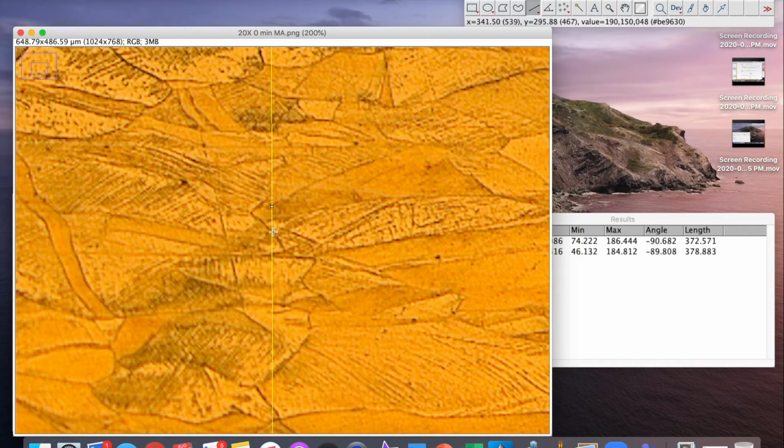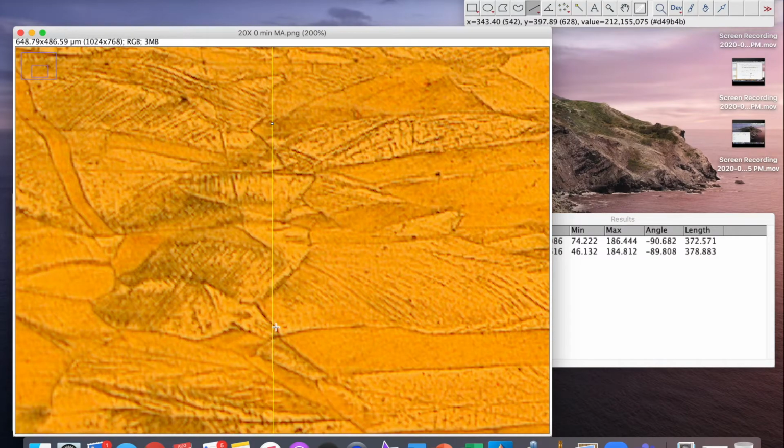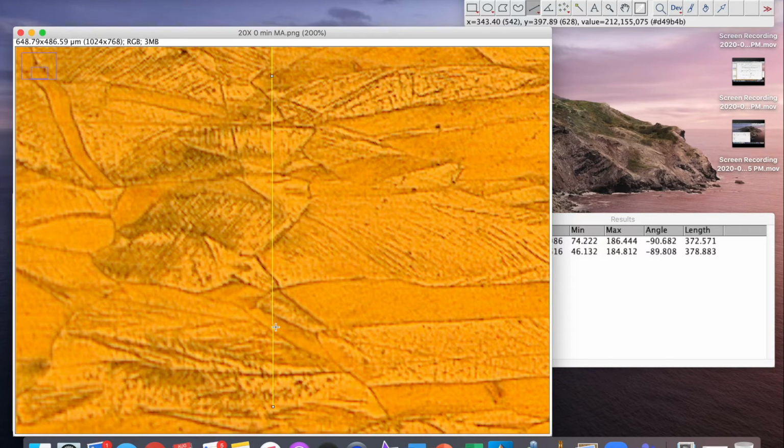Here, here, here, here, and I think potentially here and here, here. So as you can see, you keep going and you'll get all of these.